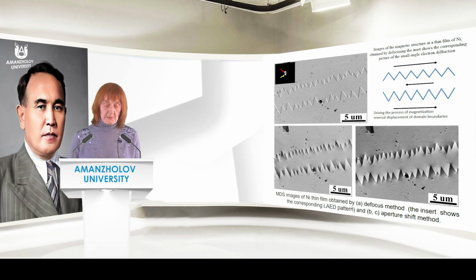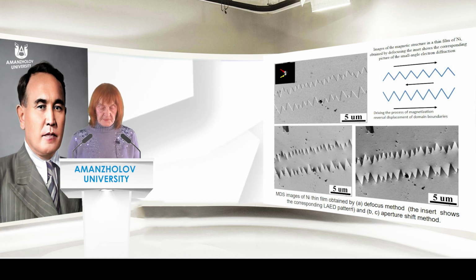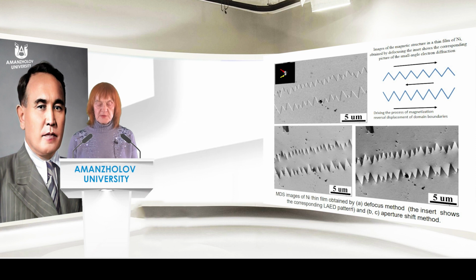The low-angle method is most preferred to determine the magnetization vector direction in thin foils and epitaxial films due to the lack of ripple, which is characteristic of polycrystalline and amorphous films.